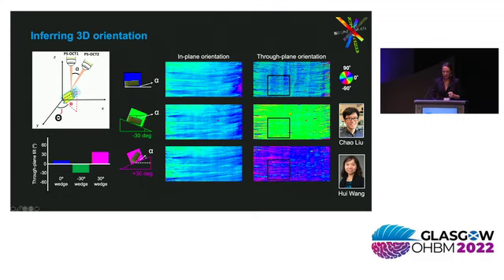He imaged a sample of the corpus callosum, tilted either by 0 or by 30 or minus 30 degrees, and imaged it with multiple incidence angles, and was able to show, first of all, that the in-plane orientation is consistent, and that the through-plane orientation is accurate compared to how the tissue is actually tilted. This is going to be a very important step towards being able to follow axonal orientations in 3D across the brain.